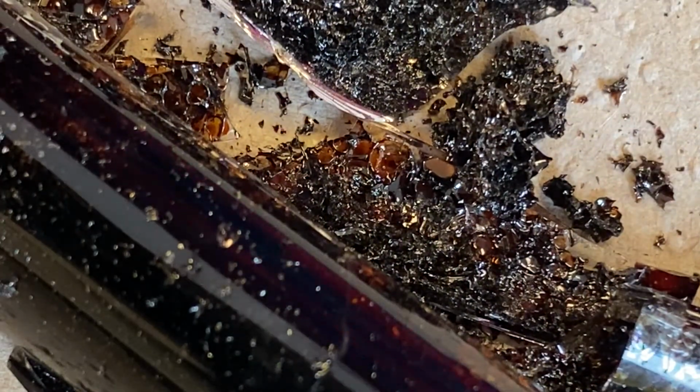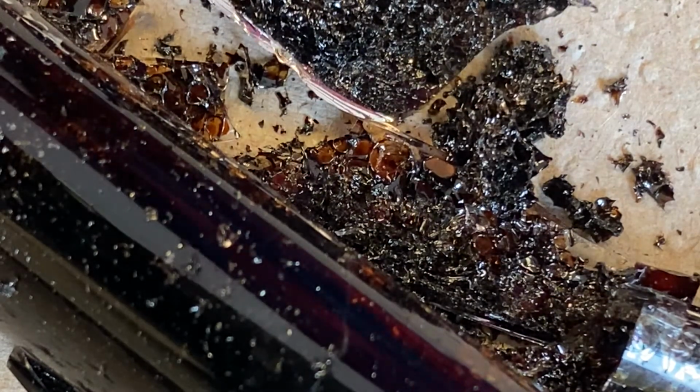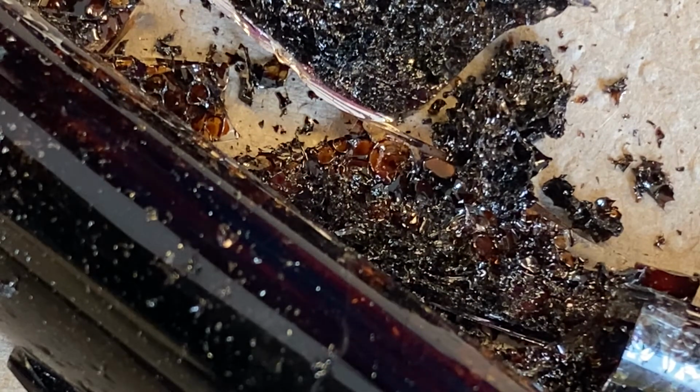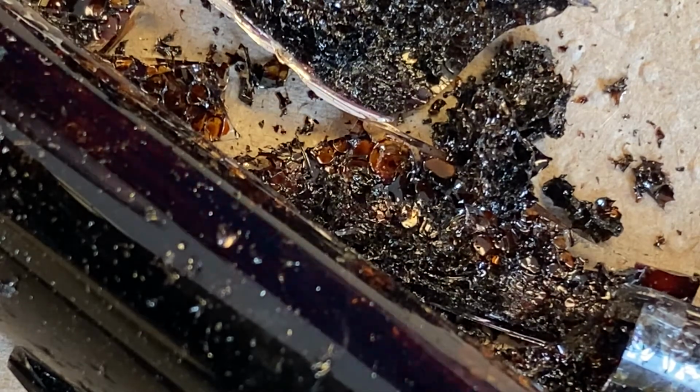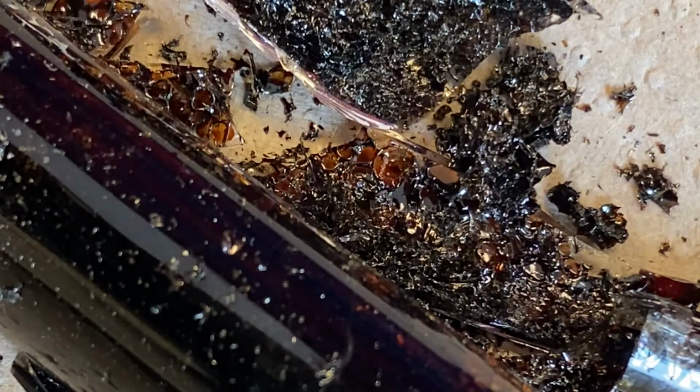Size is different than what we started with. The shape I would call irregular, okay? It conformed to the shape of the test tube. It used to be a liquid, but it's turned into a solid now. Its color is brown or black as opposed to white, what we started with. Its hardness is less hard even than sugar is.